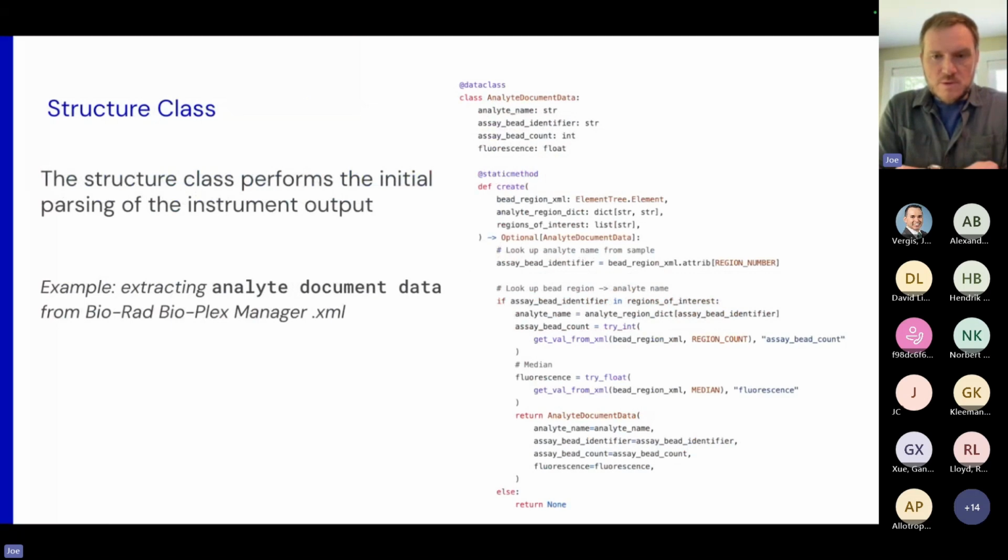The other thing is the two-part approach to the way the code works. If you look at the code of any of the converters, you see there are two scripts: the structure script and the parser script. The structure script goes through and extracts all the information into these Python classes. Here, an example is pulling the data out of Bioplex Manager into the data class for an analyte document.